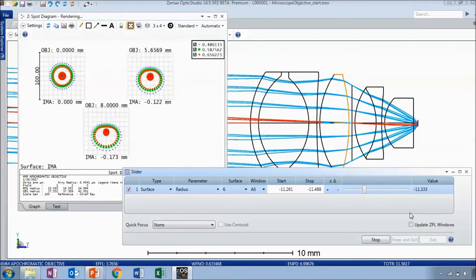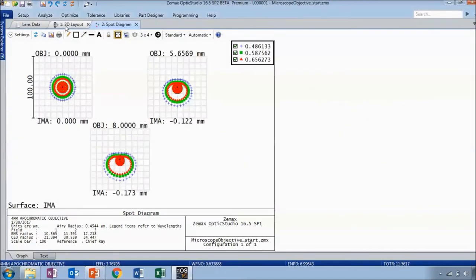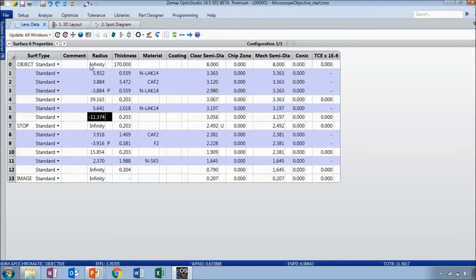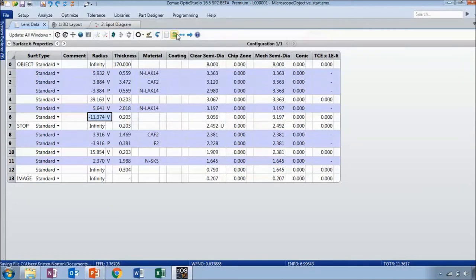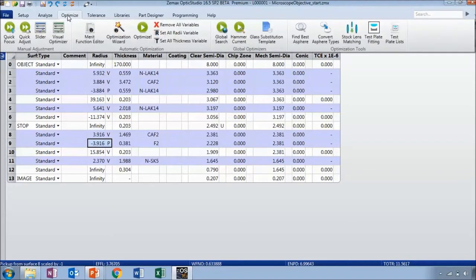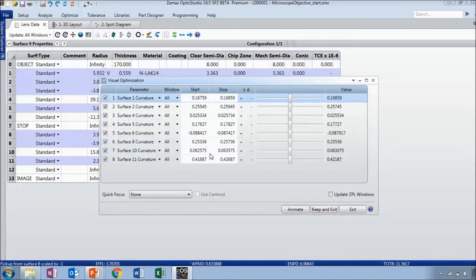You can also animate the slider, in which case it will automatically update the windows you've specified as it moves along. Now let's say we wanted to vary all of our radii of curvature at once. We'll go to the optimize tab and use the shortcut button to set all radii variable. Now all radii that are not infinity and do not have a pickup assigned to them have V's, indicating they can vary when we run an optimization.